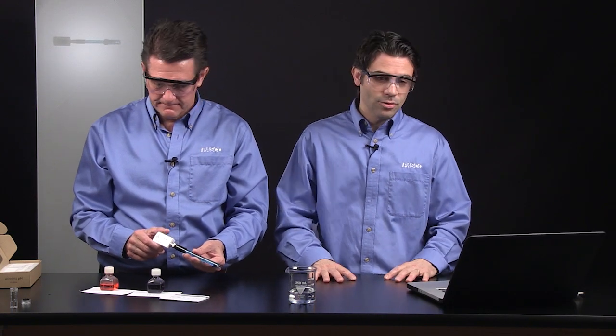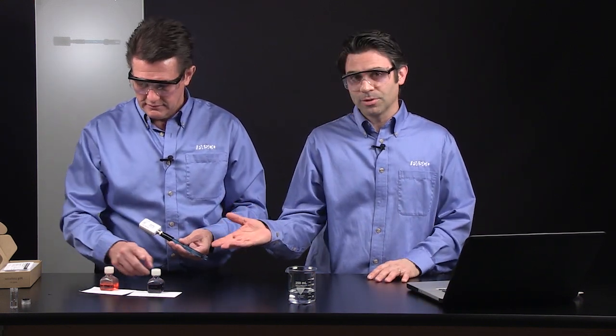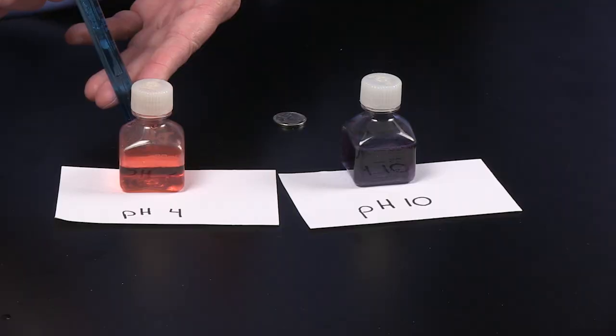Now my pH measurement will show up on the screen. In most cases, if you're just doing relative measurements of pH, you can start using the pH sensor right now. If you feel like you need to calibrate, there is an easy way to do that and you can check out our separate video. You'll just use some pH buffer solutions — put the probe in for a moment and it's pretty much calibrated. That's very useful if you want to do quantitative measurements or if you notice your pH sensor is a little off.